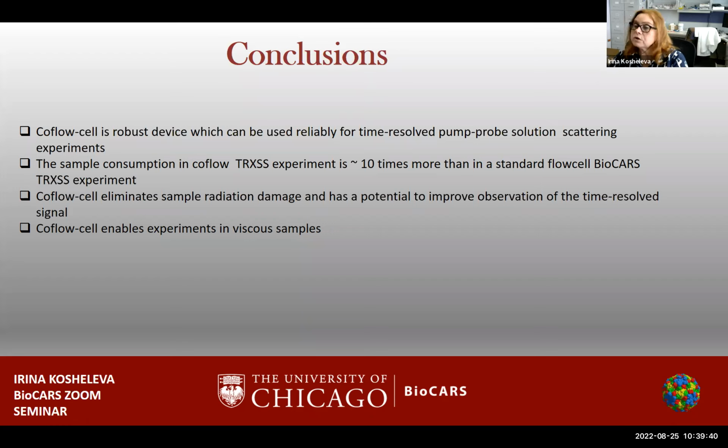In the horizontal geometry, when we are using a more dense sample, I do not observe a good laminar flow. Only a low density sample can be used in the horizontal direction because of mixing and fluid dynamics.